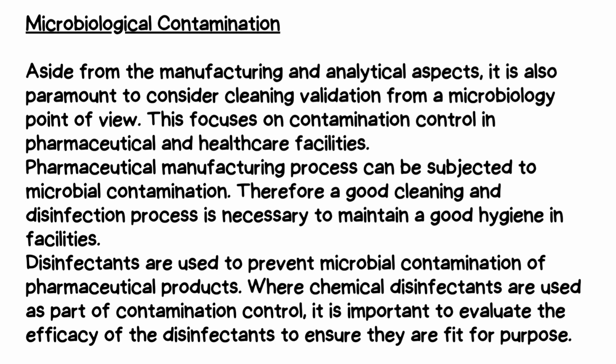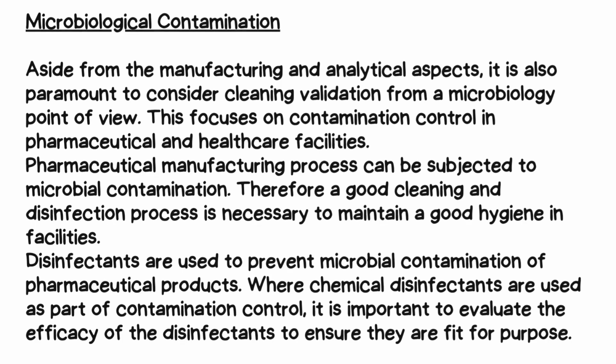Microbiological contamination. Aside from the manufacturing and analytical aspects, it is also paramount to consider cleaning validation from a microbiology point of view. This focuses on contamination control in pharmaceutical and healthcare facilities. Pharmaceutical manufacturing processes can be subjected to microbial contamination. Therefore, a good cleaning and disinfection process is necessary to maintain good hygiene in facilities. Disinfectants are used to prevent microbial contamination of pharmaceutical products. Where chemical disinfectants are used as part of contamination control, it is important to evaluate the efficacy of the disinfectants to ensure they are fit for purpose.